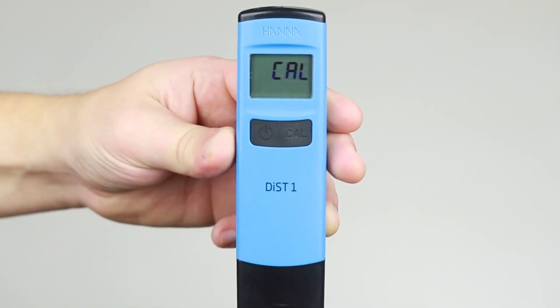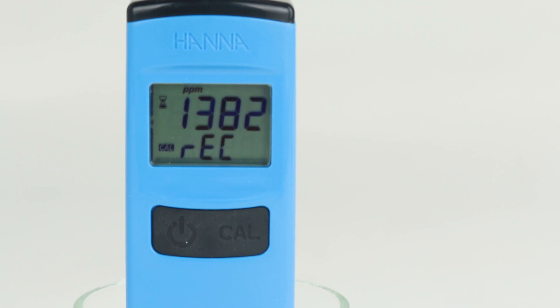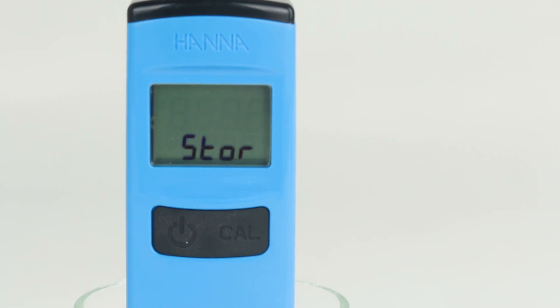To calibrate the meter, press the CAL button while the meter is on to enter calibration mode. The meter prompts for the appropriate conductivity standard. Once the solution is detected, REC will be displayed. Once the value is accepted, STORE is displayed and the meter returns to measurement mode. The meter is now calibrated and ready for use.